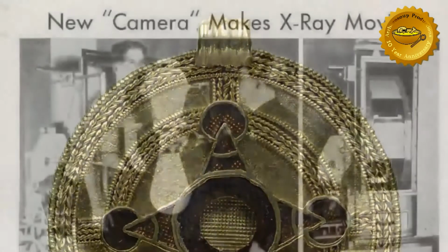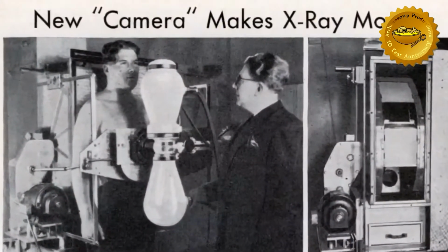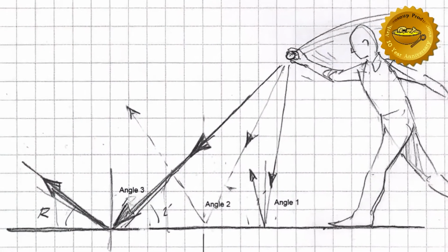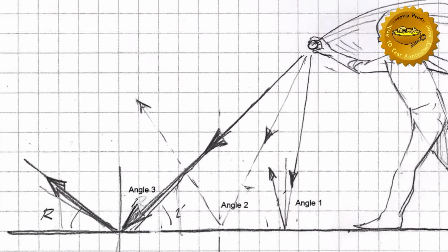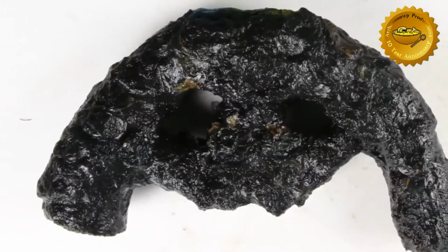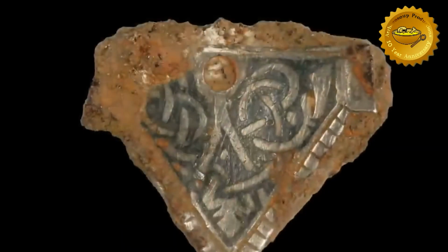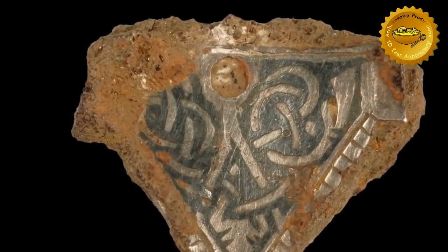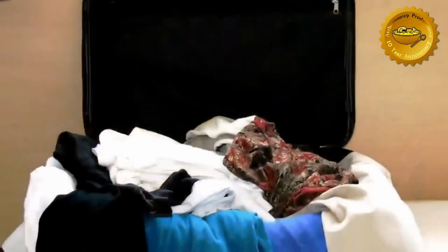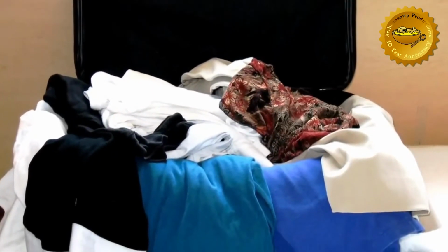However, before we all get carried away, it should be pointed out that EDXF does have limitations. For example, it can only analyze the very surface of an object. With rusty objects, this can have serious ramifications. We only really learn what the concretion is made of. This can mean that details of an object are invisible to EDXF. It's also worth pointing out that the test chamber is very small, so you're limited by which objects you can actually fit into the machine.